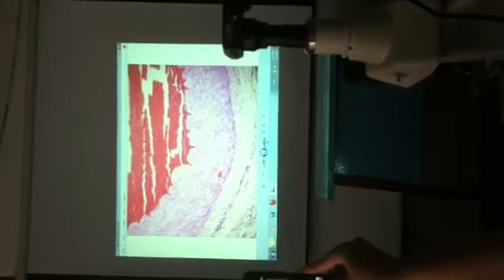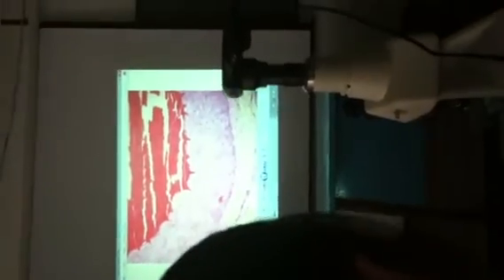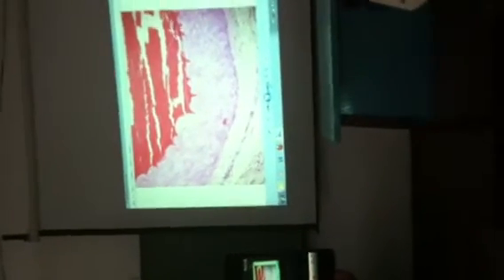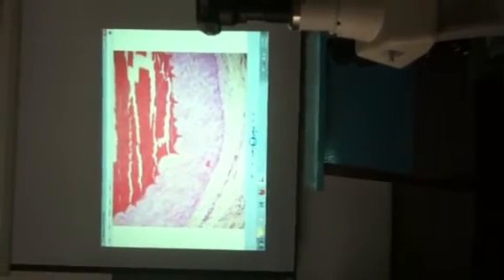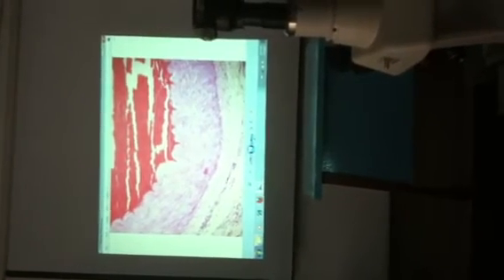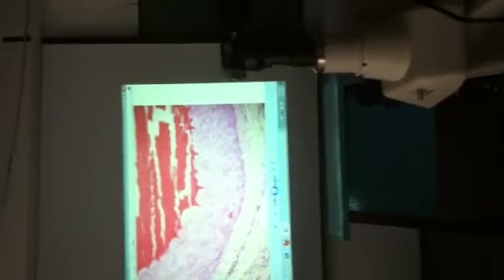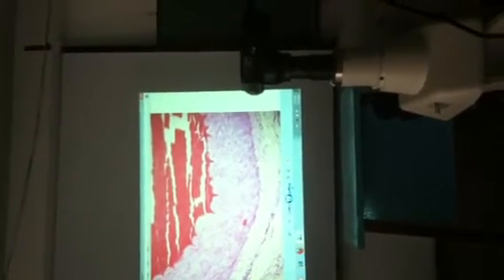What did we see? Some of you drawing surface view. Can you see single layer on surface view? Pag stratified squamous, several layers, ang surface view pareho sa simple squamous. Kaya nga nandyan sa inyong manual, on edge, side view, get a coin. Ay, wala akong coin. Get a coin. Ang on edge, ganyan. So you can see single layer.